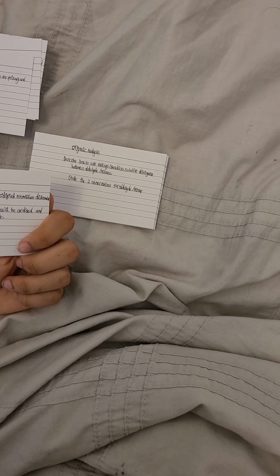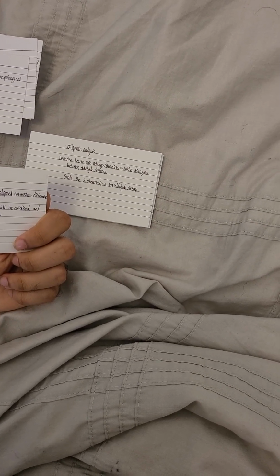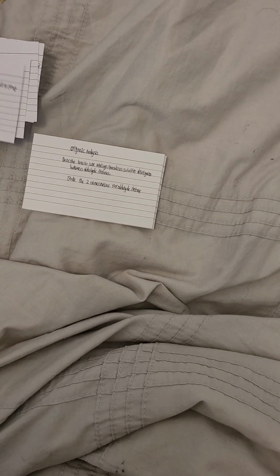To distinguish between them, when we need the same result, we add excess alcohol to 7 cm³ of acidified potassium dichromate in a round bottom flask. Gently heat the flask. The alcohol will be oxidized first, and therefore the product is distilled immediately, so we can collect it.